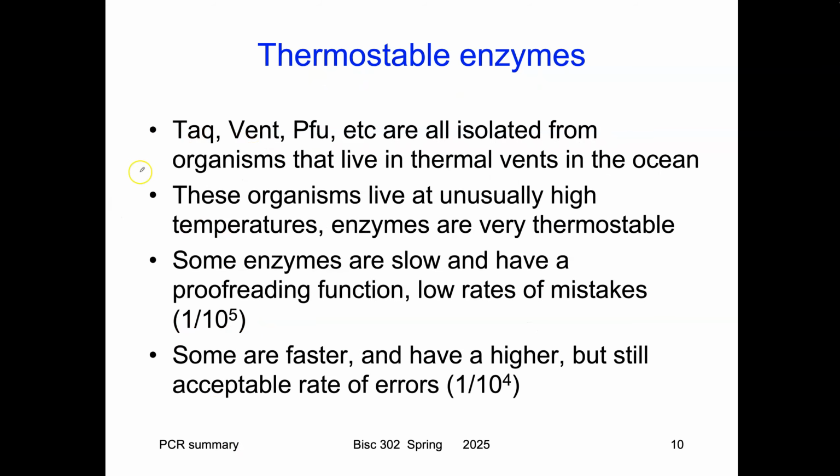Okay, so the thermostable enzymes, as I said, are isolated from organisms that live in thermal vents in the ocean or the hot pools in places like Yellowstone Park and some of these hot springs. And so the enzymes don't break down when you heat them.